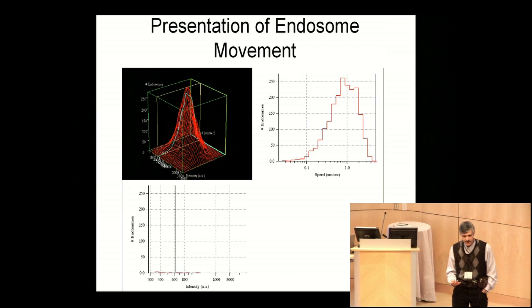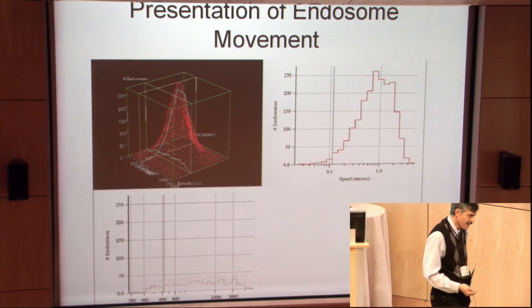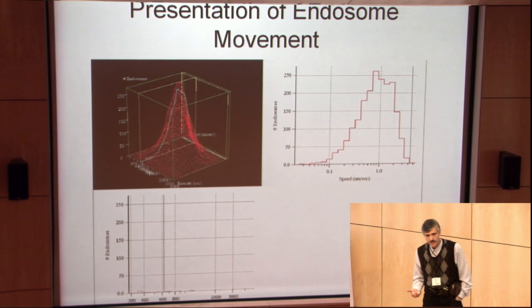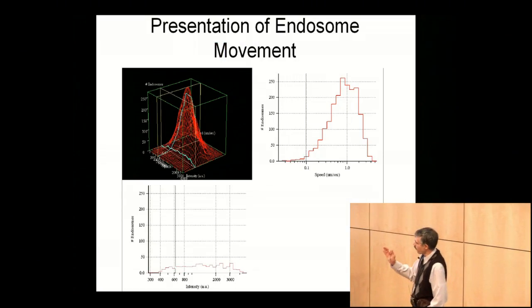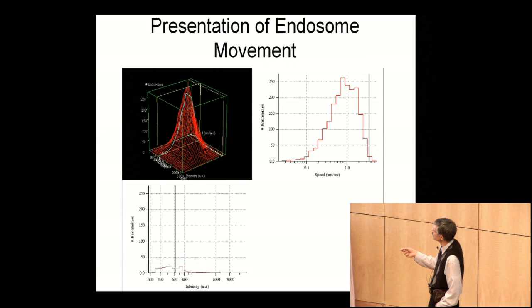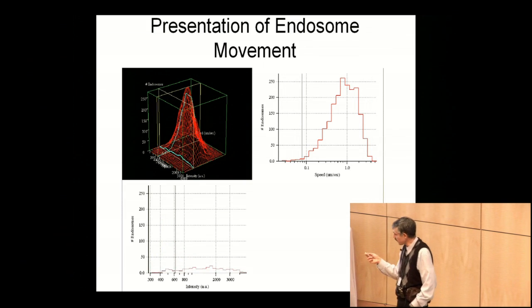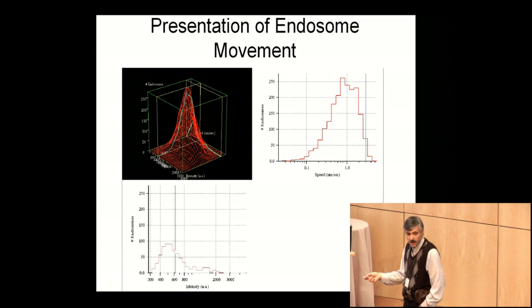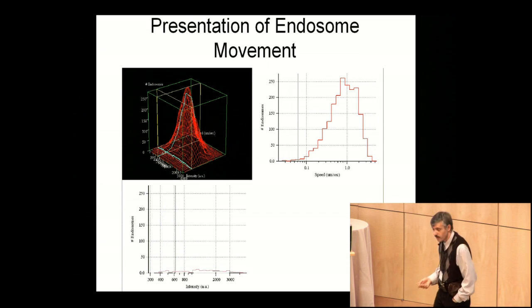Just looking at this presentation, I have an insight that in reality Rab5 has a negative regulation role on the speed of endosomes. So if you go from the slow endosome to the fast one, you go from the bright endosome to the dim one. So this shows a negative regulation role of Rab5.